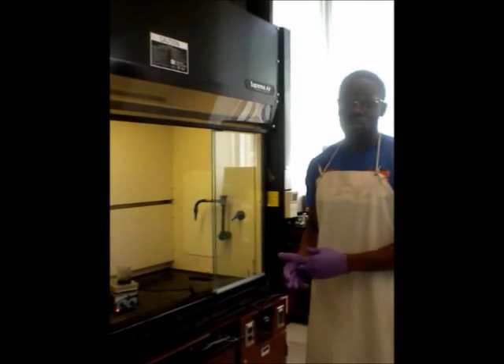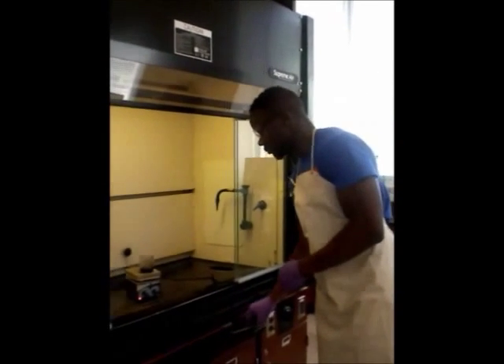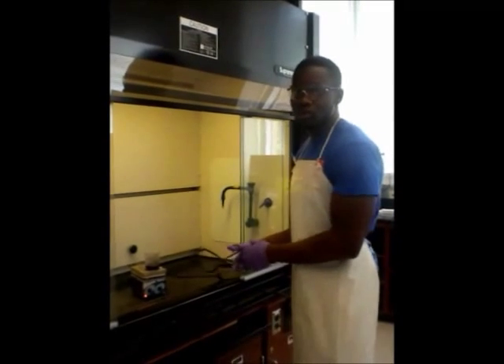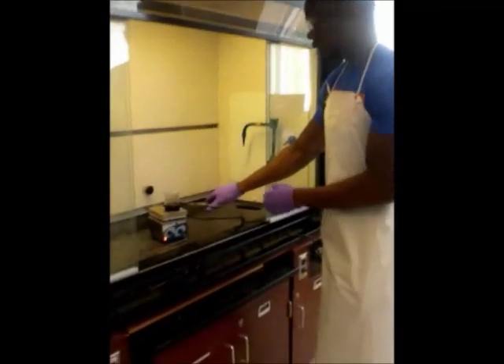If too much foaming occurs, you will lose some of your crystals and your percent yield will be lower. What I'm doing right now is removing the solution from the hot plate and allowing it to cool inside the fume hood.